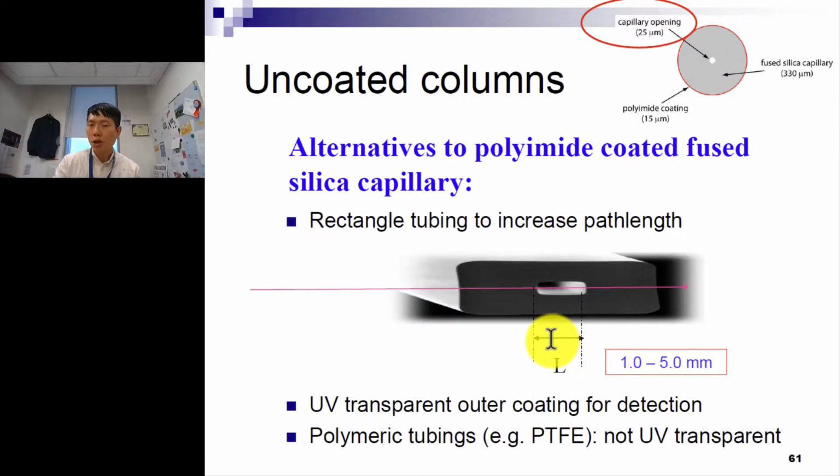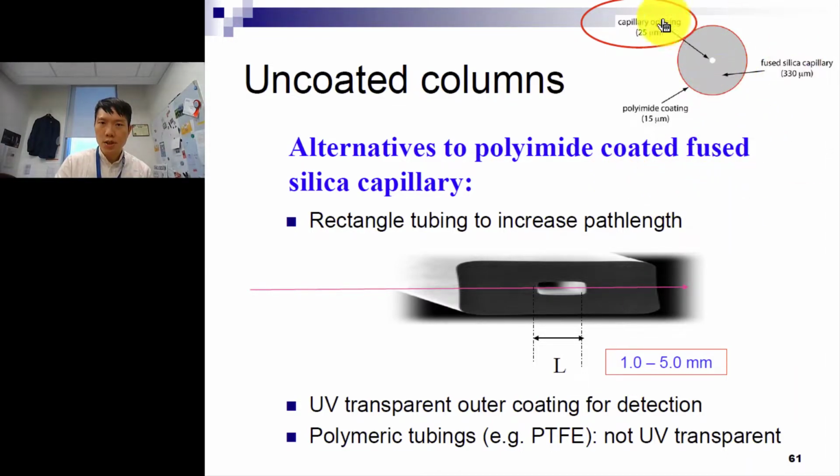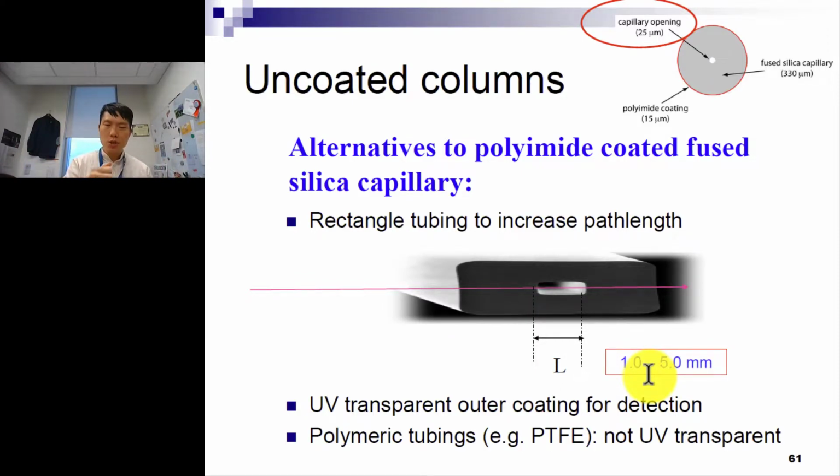So for uncoated columns, this is what you have seen in many of these lectures. This is your fused silica capillary, in this case your 330 micron. Then of course inside, you have this capillary opening, 25 micron, very narrow, and this is a UV transparent outer coating for detection. So I have shared with you in the class that your capillary, you can always burn it and you can see this transparent part, that light can pass through here.